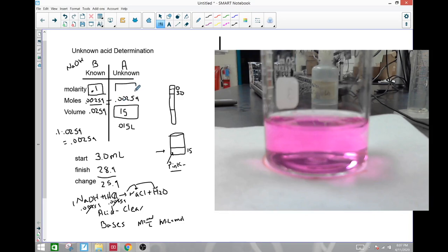So my goal is to determine the original concentration of my original solution, which is this guy right here. Now keep in mind, I destroyed my sample while I made it, but when you are testing something, maybe you're going out to a lake and you got yourself a little boat and you're just fishing around a little bit here, you grab a sample of water and you bring it back and you test it. So the sample I have, this 15 milliliter sample, is representative of my larger sample, or hopefully it is. So I destroy my sample by finding out information about the original contents of that solution, which is pretty common in testing, that it gets sort of destroyed while it's being tested.